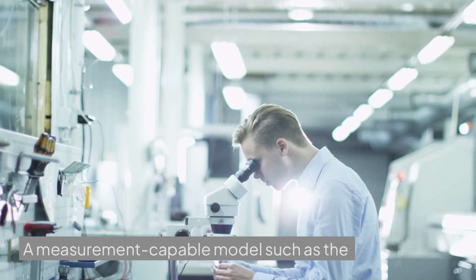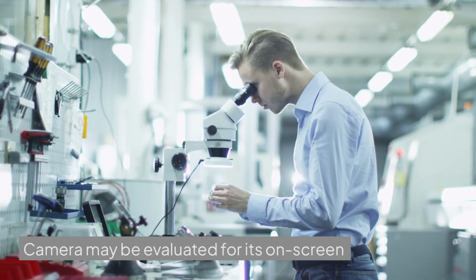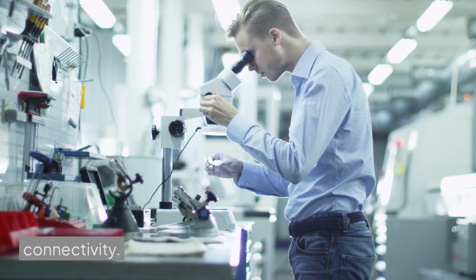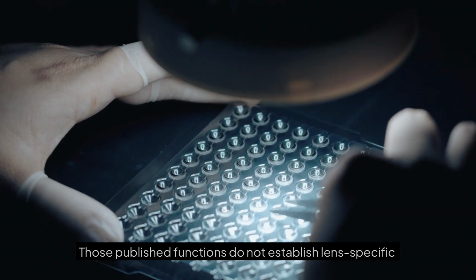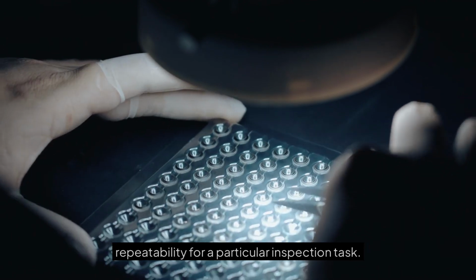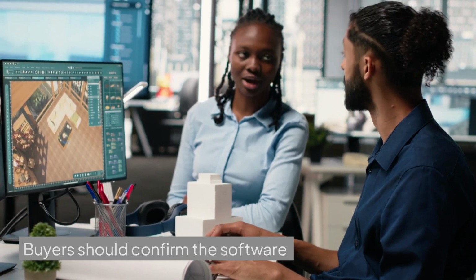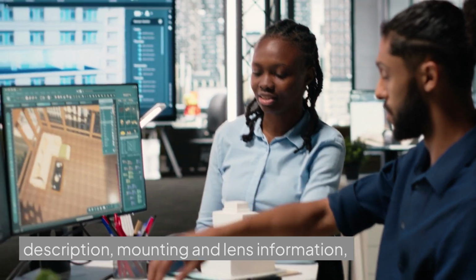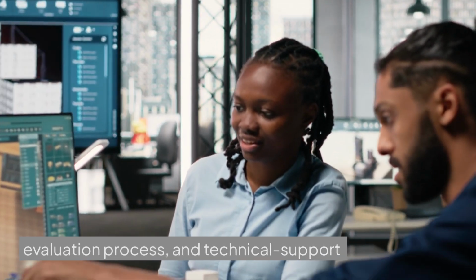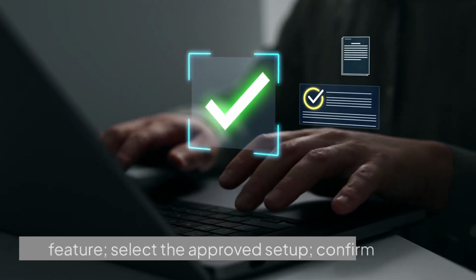A measurement-capable model such as the Fantru B36 8MP 4K digital microscope camera may be evaluated for its on-screen measurement functions and available connectivity. Those published functions do not establish lens-specific scale, calibration interval, tolerance suitability, or repeatability for a particular inspection task. Buyers should confirm the software description, mounting and lens information, supported operating conditions, sample evaluation process, and technical support route. In routine use, identify the part, lot, and feature.